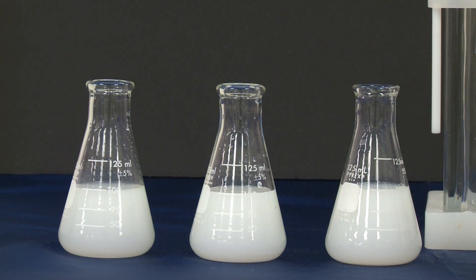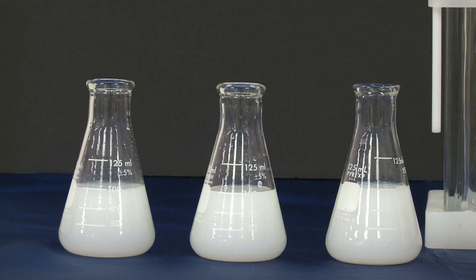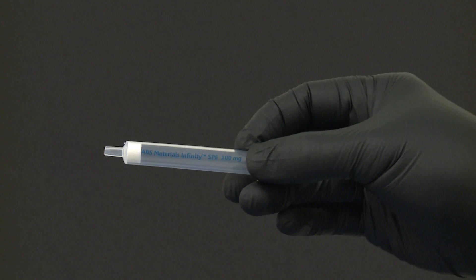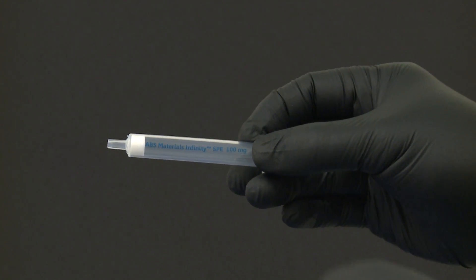ABS Materials has developed the fastest technology in wastewater sample analysis, the Infinity Solid Phase Extraction Cartridge.